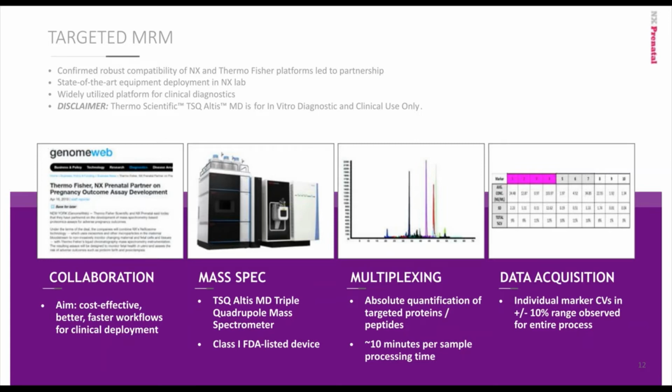And the CVs are very good over the entire process. That is from collection all the way through analysis, as you can see over on the right, generally in about the plus minus 10% range.